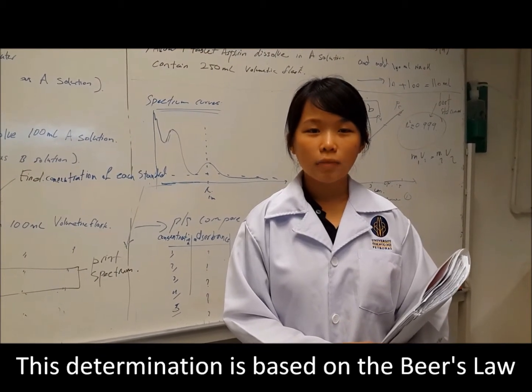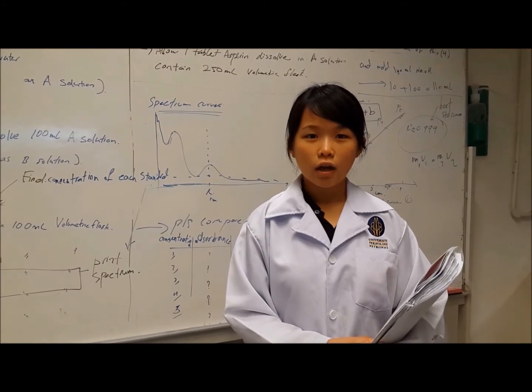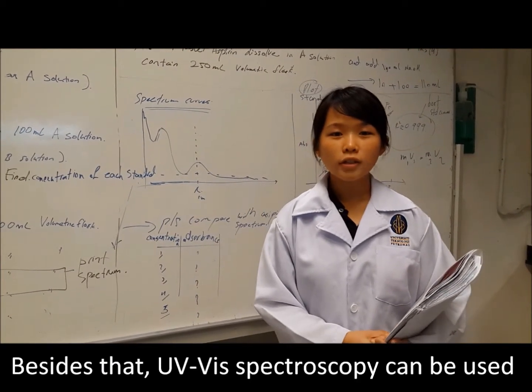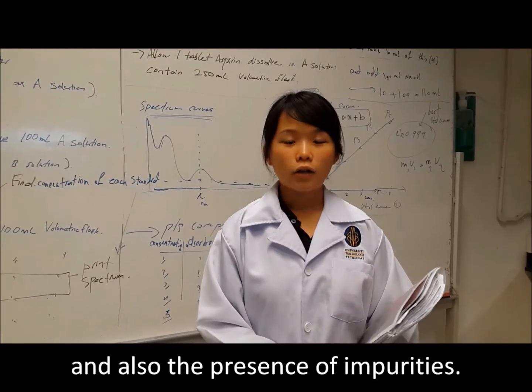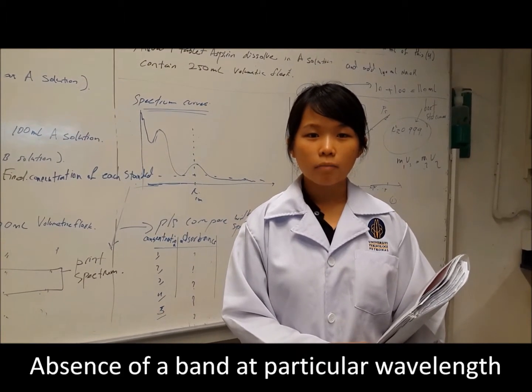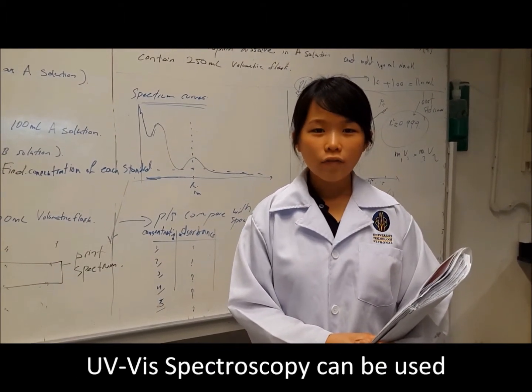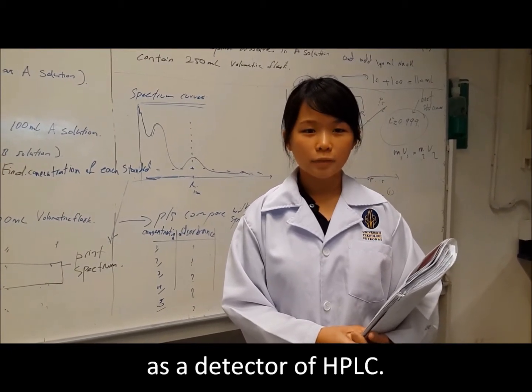This determination is based on the Beer's law, which is A equals negative log T and also equals epsilon times l times C. Besides that, UV Vis spectroscopy can be used to detect the functional group of a compound and also the presence of impurities. Absence of a band at a particular wavelength is regarded as the evidence of absence of a particular group. Other than that, UV Vis spectroscopy can be used as a detector of HPLC.